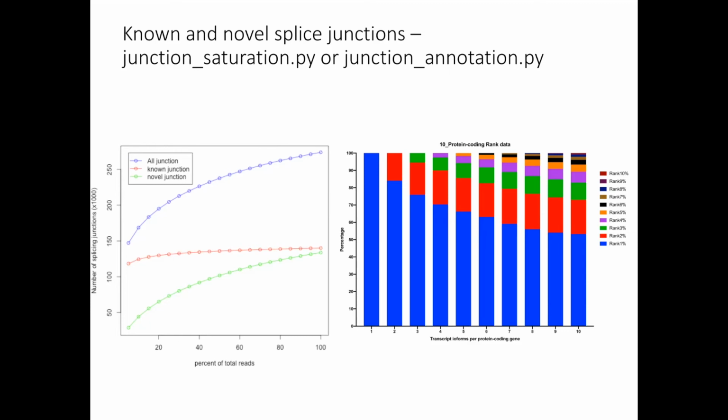And we have also a question from Matus. Yeah, thank you. If you have a significant number of reads mapped to multiple loci, is there anything you can do about it and use it, or is it just useless information? Depending on what program you're using downstream, you can include it or not.